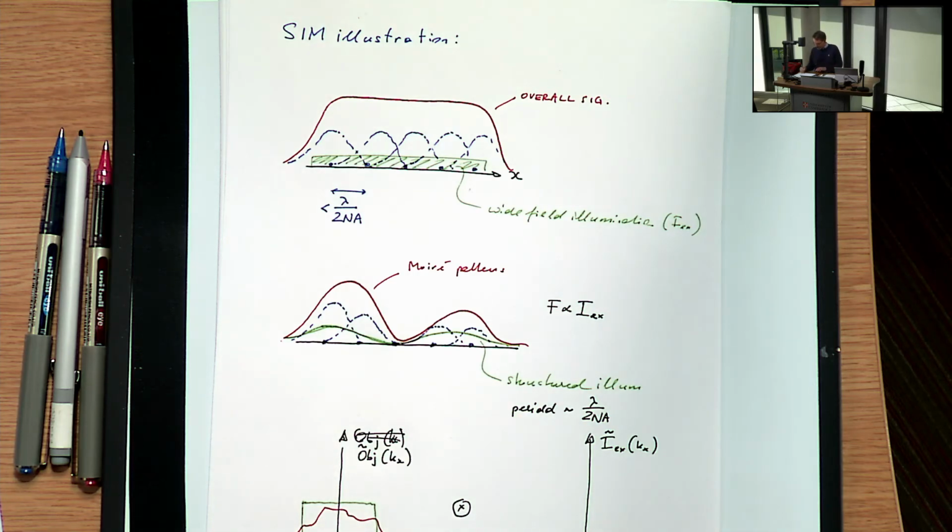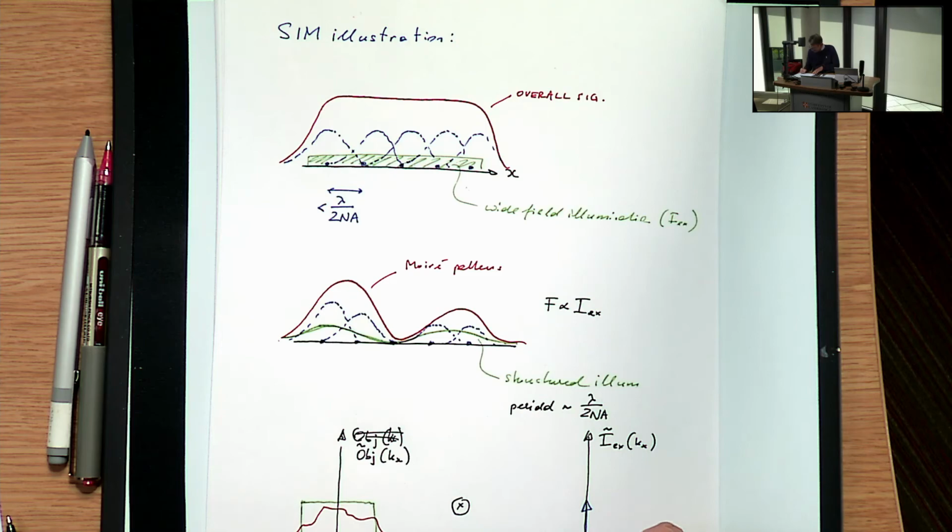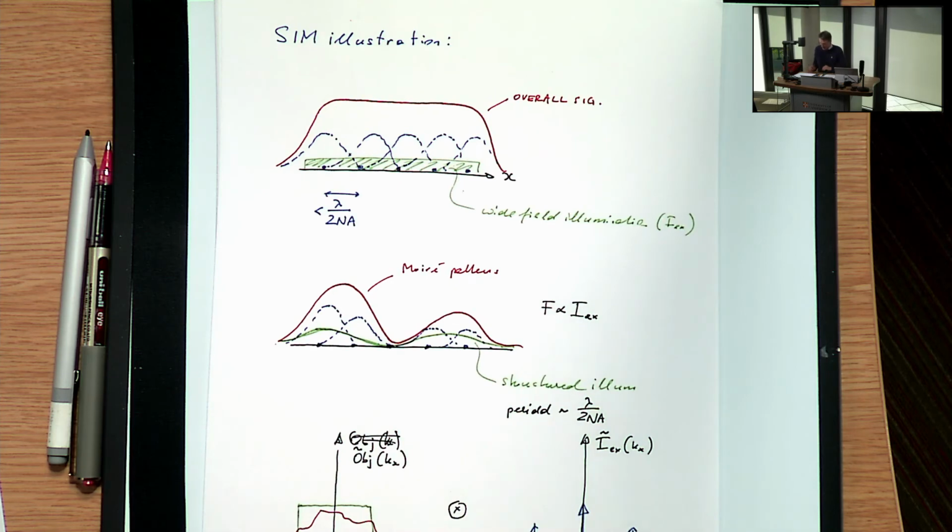And that convolution, of course, gives us this spectrum as we had before for a sine wave. Now let's look at what might happen at a frequency here. This one's outside the passband. Let's call that K1, and let's call these frequencies plus K0 and minus K0.